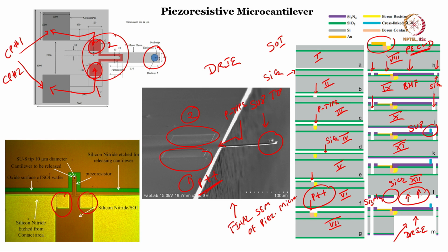So, I hope that now you understand the importance of AFM, the importance of STM. We can also fabricate a piezoresistive microcantilever. Now we are saying resistive, that means you apply pressure, there is a change in resistance. So, this can also be used to measure the roughness of a film. For example, if there is a piezoresistive cantilever, this my hand with a tip, and you are scanning it across the sample, depending on the roughness this will bend.